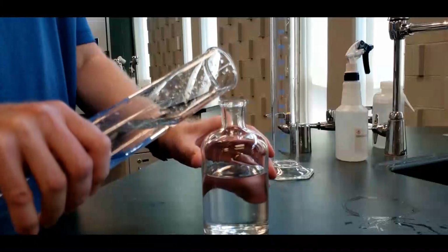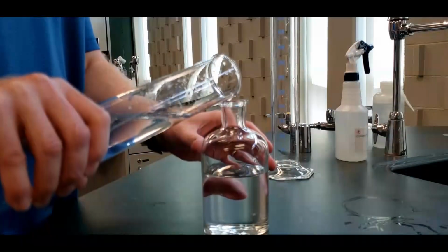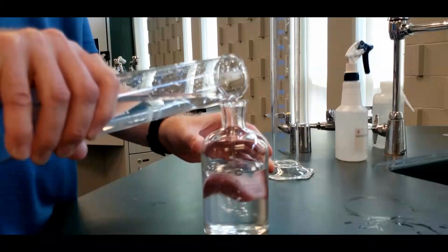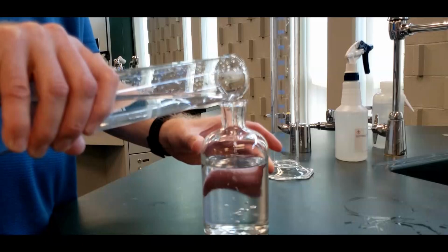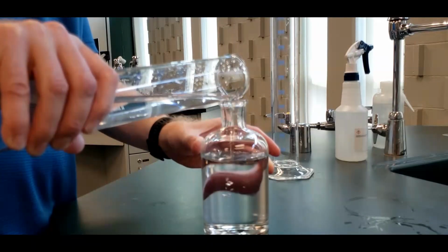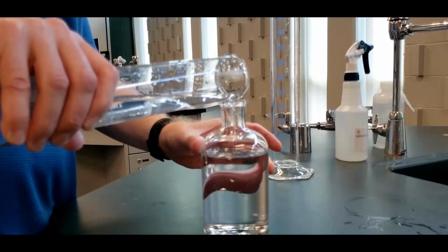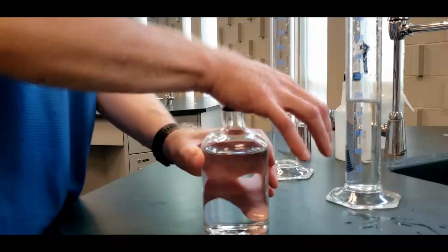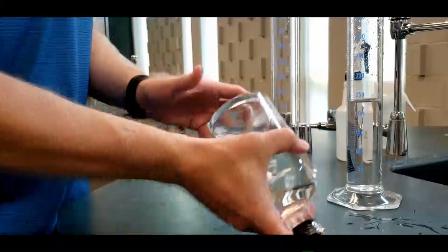And then we're going to add more water here. So that's already kind of mixed. We add this in, then we're going to mix it up some more. We're just going to add to about the shoulder of the bottle, and that's going to be around 500 mils. That's close enough because we're going to figure out the exact concentration later. Cap it off and then just shake it.